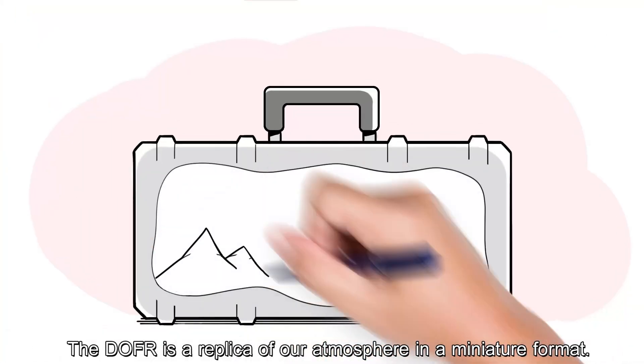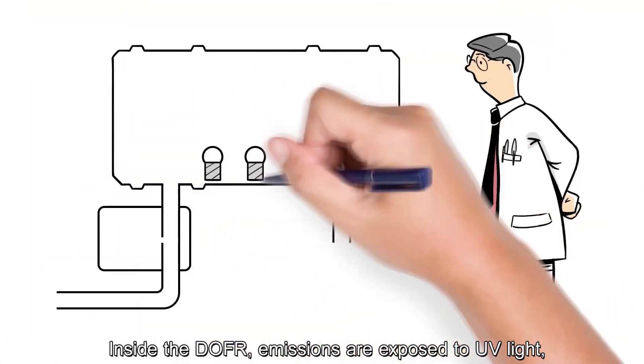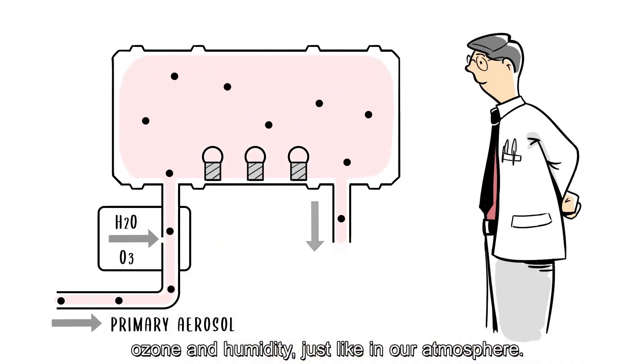The DOFR is a replica of our atmosphere in a miniature format. Inside the DOFR, emissions are exposed to UV light, ozone, and humidity, just like in our atmosphere.